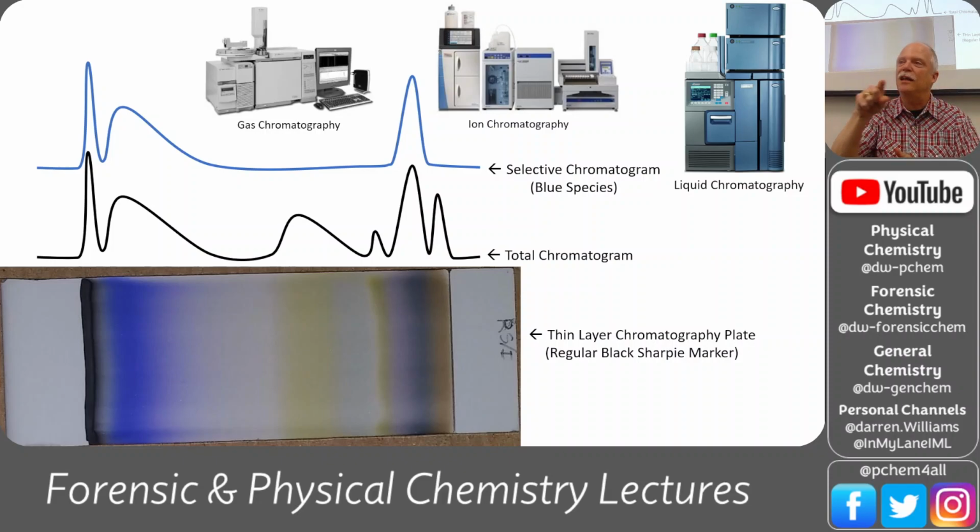With mass spec, you can imagine you can sit right on a mass and you don't see it if it's not there. But then the molecule that has that mass would come out and you would see that peak come up. You could have all kinds of junk coming through and hitting the detector, but you're only looking for that particular mass. So you would just ignore all of those other signals until you see that mass.